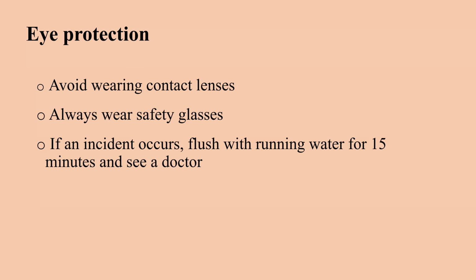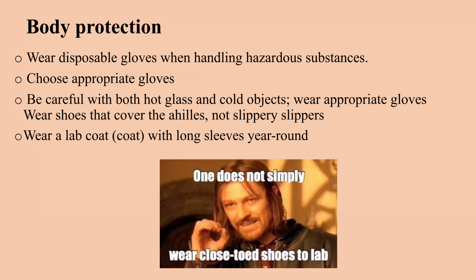You should always wear glasses, and you should know where the running water is if you have such damage. After it, it's necessary to have an appointment with an ophthalmologist to check that all is okay.